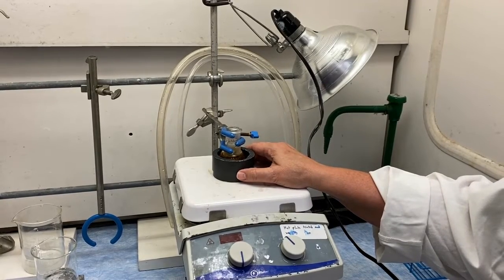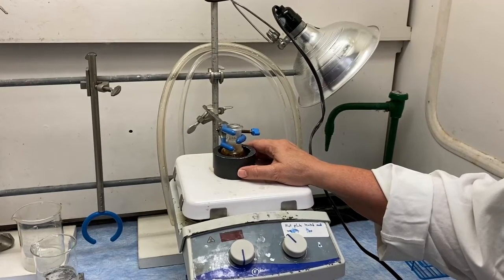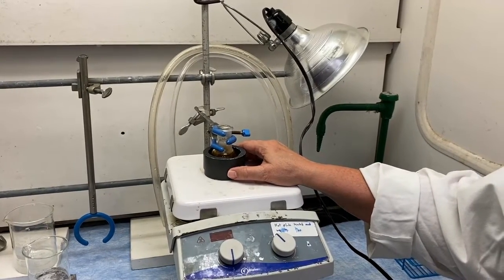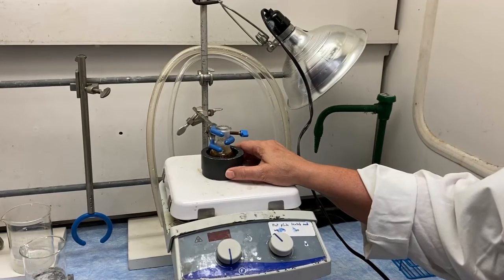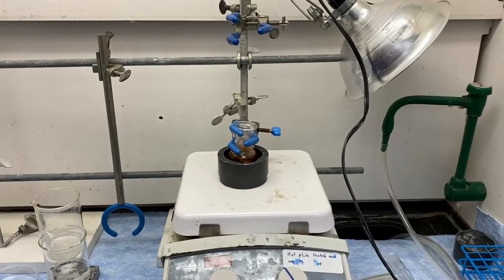The amide will take away the hydrogen bonding capabilities that the amine has, causing this to become a very nonpolar compound. Now that we have a nonpolar compound, we can go ahead and use water solubility to help us isolate this compound. Okay, so now we're gonna go ahead and add the acetic anhydride.